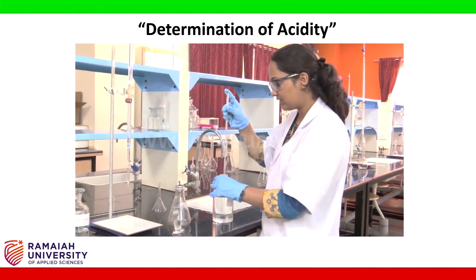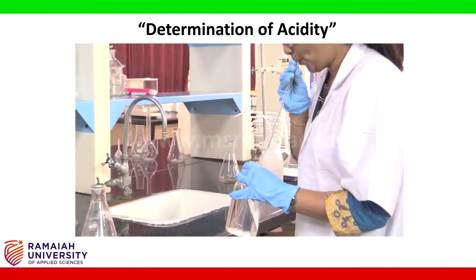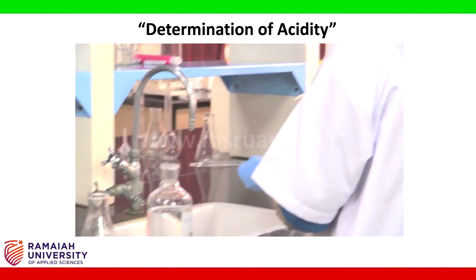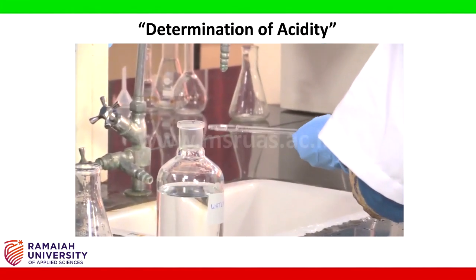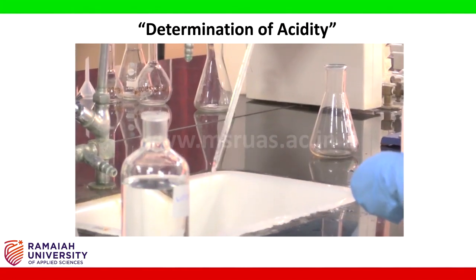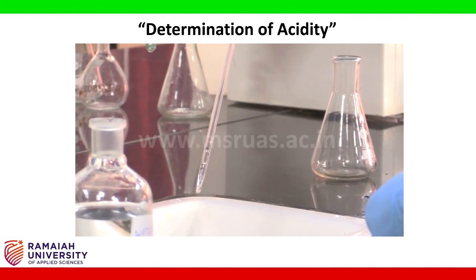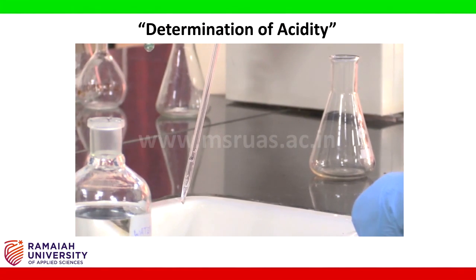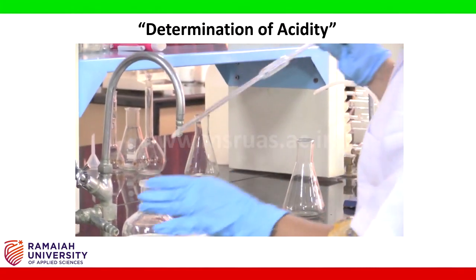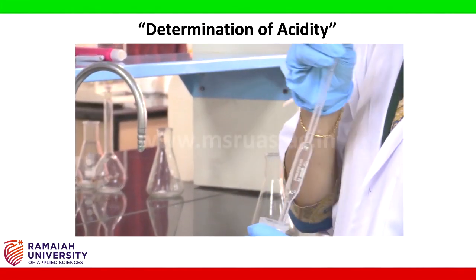Before that, we need to rinse the pipette with the water sample. So now we have to pipette out around 10 ml of the sample.